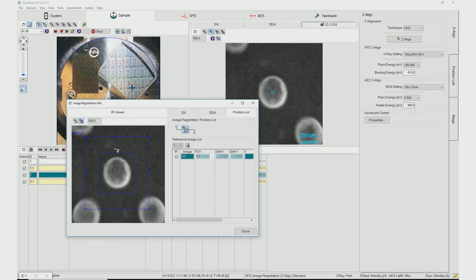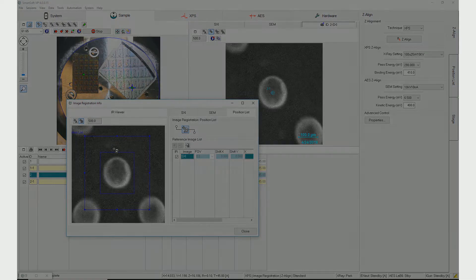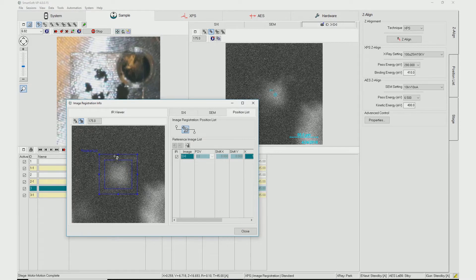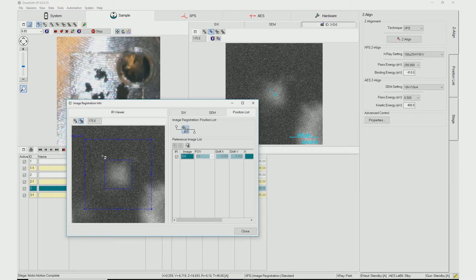Image Registration is based on contrast changes in X and Y to correctly position the X-ray beam. In this respect, any type of SXI image and feature can be used, whether it's a geometric shape like the 40 micron square wafer pad, or the irregularly shaped 25 micron manganese carbonate particle.